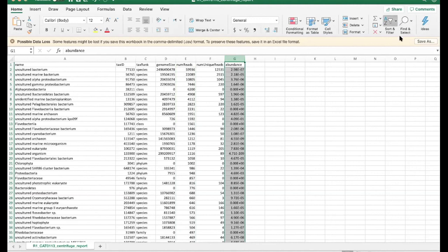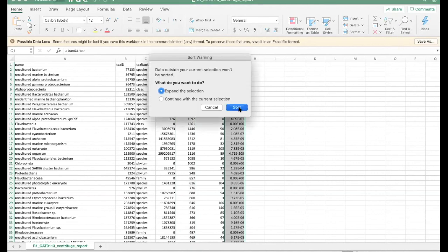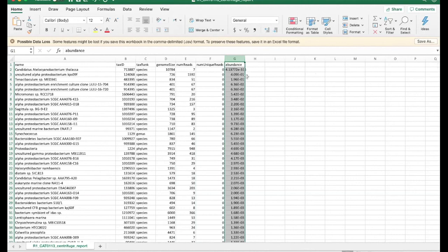If I was sorting by abundance, if you ignore this weird first row, which I don't know why it always shows up first, these would be your most highly covered genomes. And those make sense. You have some alpha proteobacteria, you have cyanobacteria, Synechococcus, a Micromonas, which is a microbial eukaryote. All of these make sense in a marine sample.